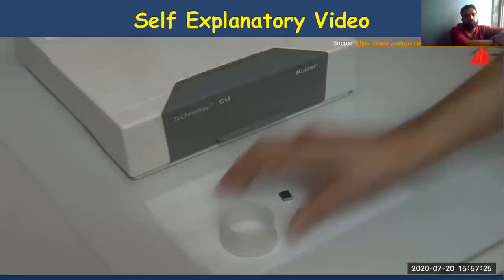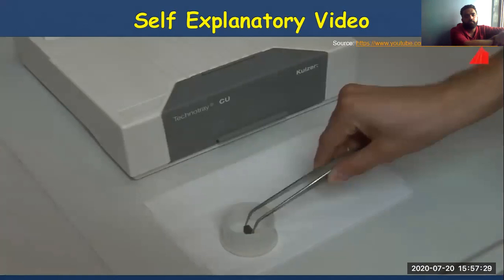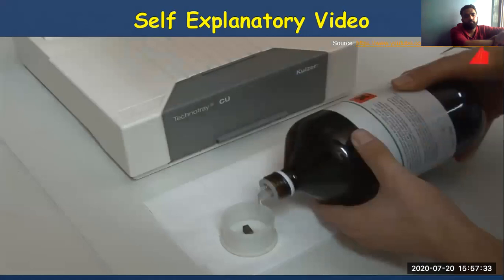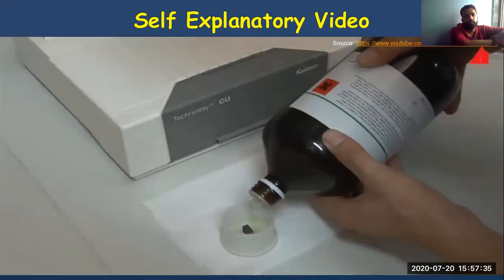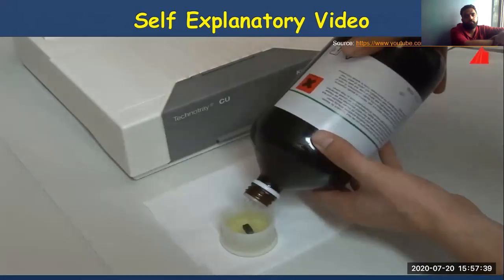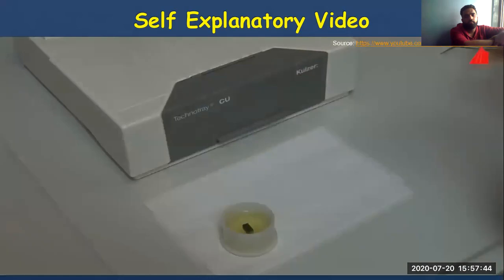The material tester picks up the clean specimen and carefully places it into one of the molds. The intended plane of examination is at the bottom. Then he pours liquid resin into the mold. A thin layer of grease at the inner surface of the mold acts as a release agent. This ensures that the cured resin can later be released easily from the mold.